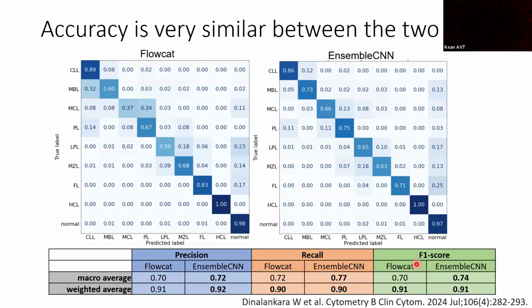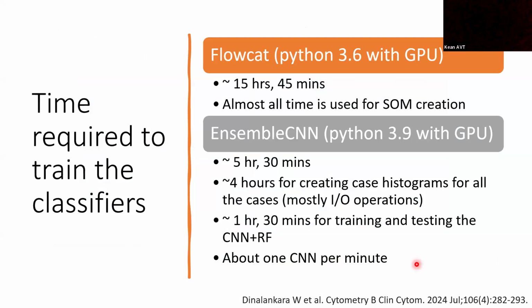And so what do we take away from that? Actually, this speaks to the importance of the quality of your data. So if you have a representative data set, it might not matter so much which machine learning algorithm you're actually using, because at a certain point, the accuracy is not improving a whole lot. So if you're not really sure which machine learning algorithm to use, I would say just pick one that you can get to work and start with that and go from there.